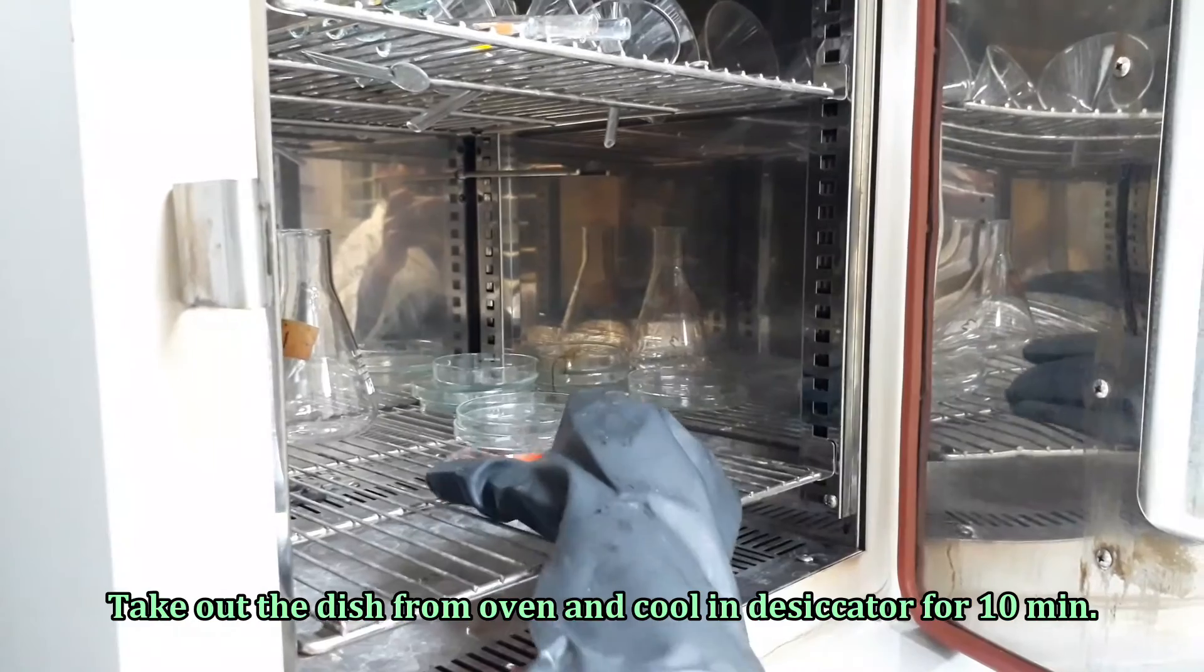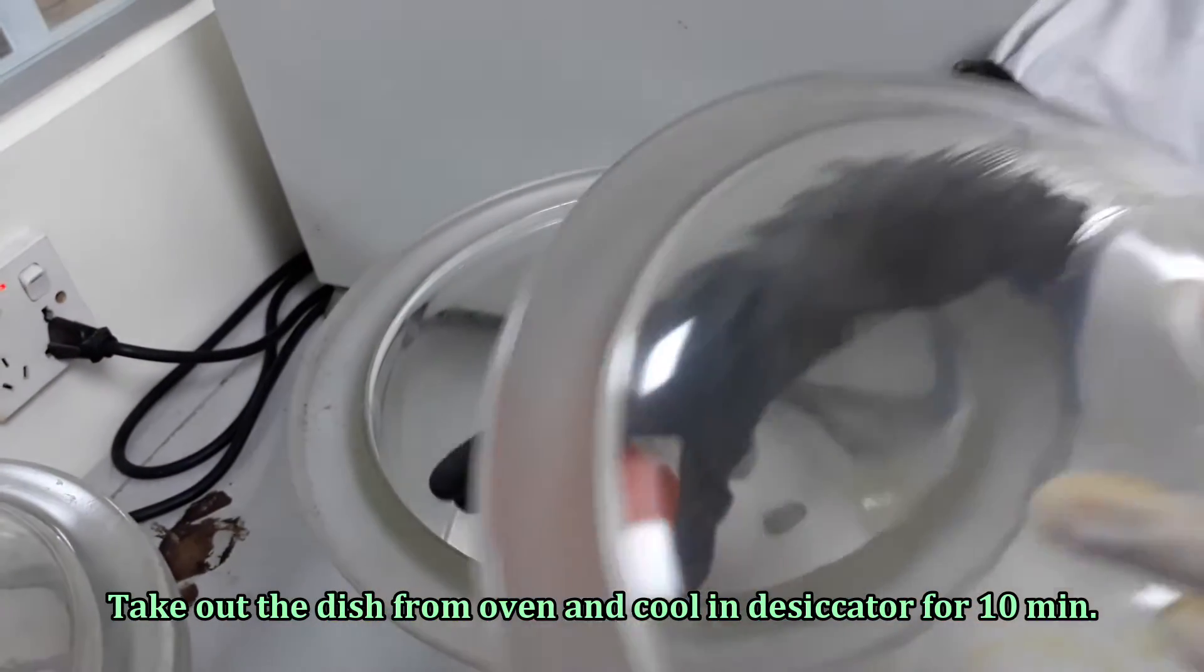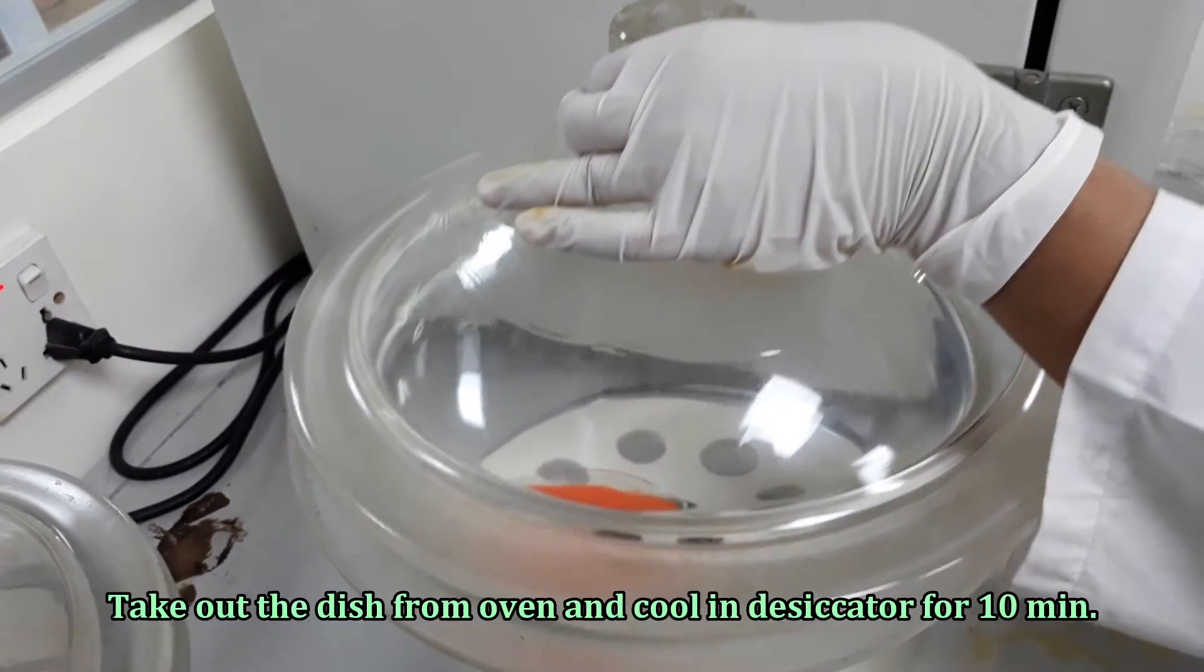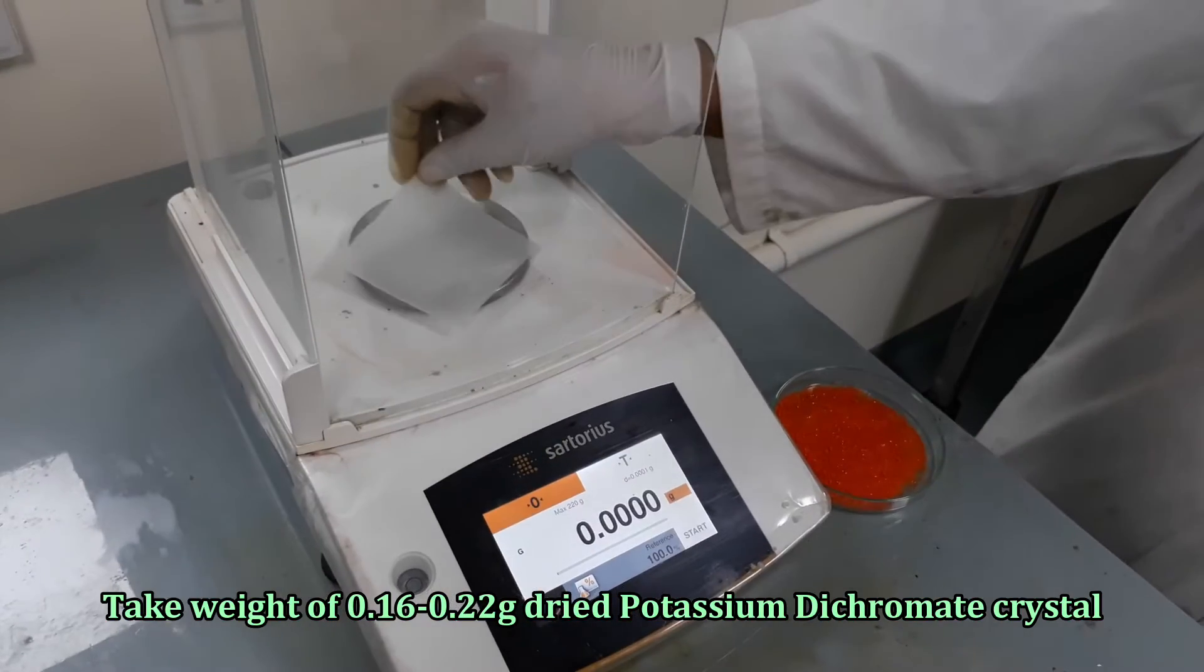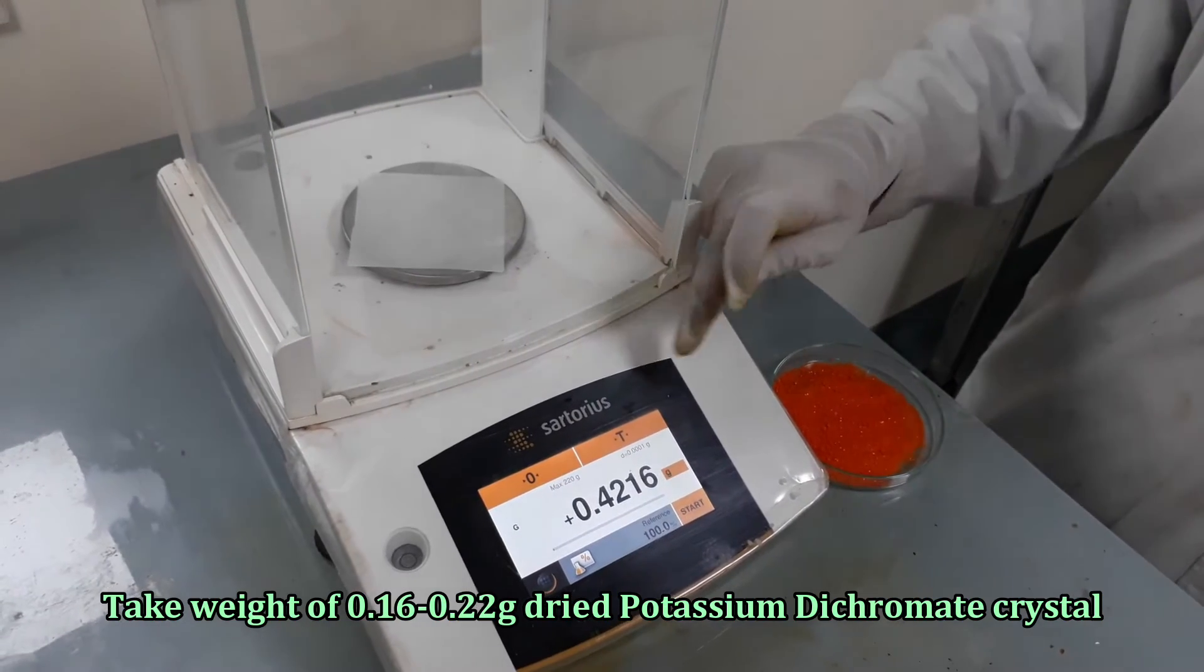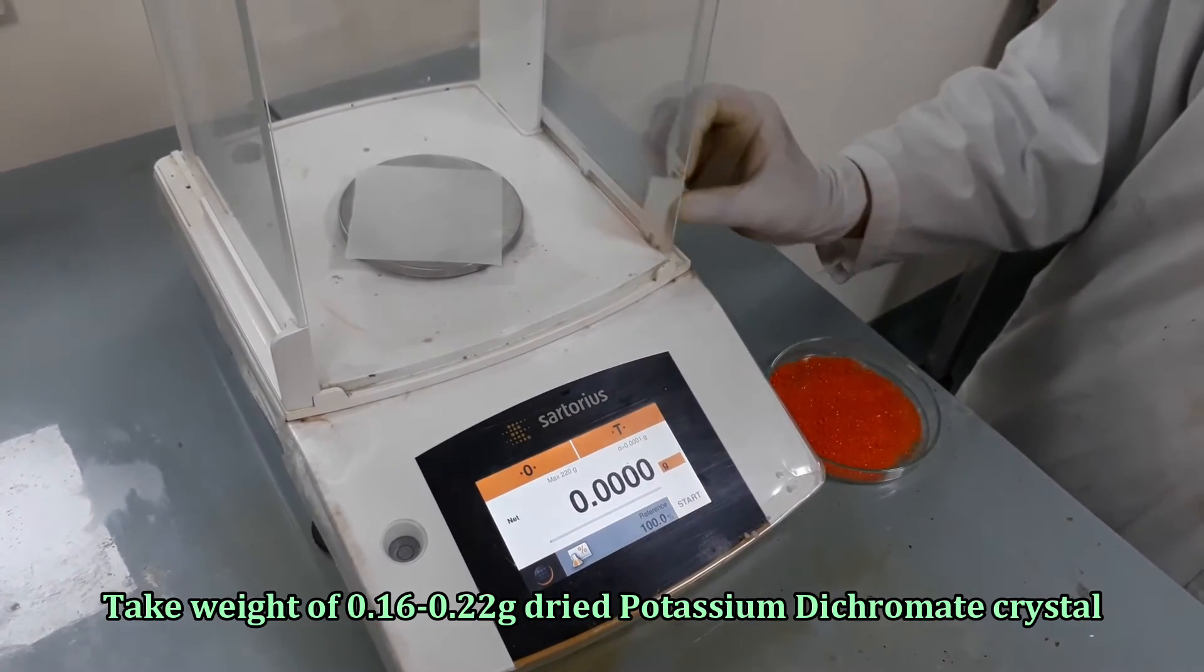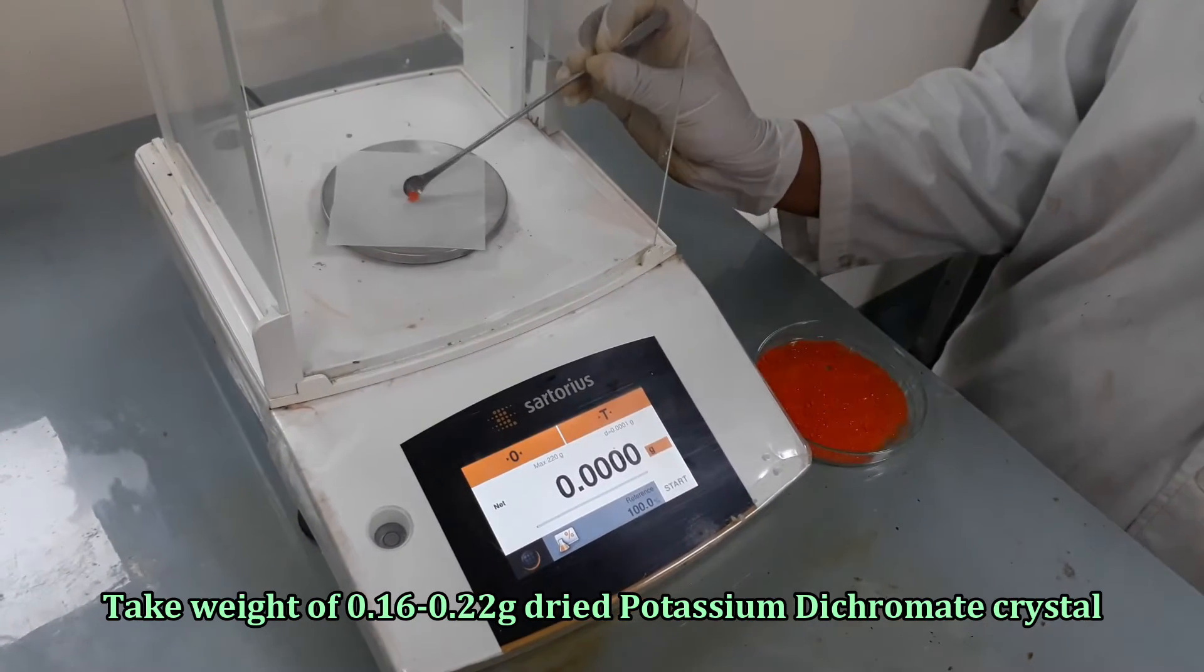After drying, cool the potassium dichromate in a desiccator. Take 0.16 to 0.22 gram of dried potassium dichromate crystal into a conical flask.